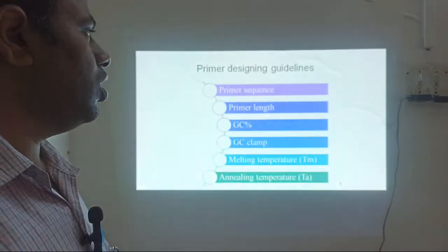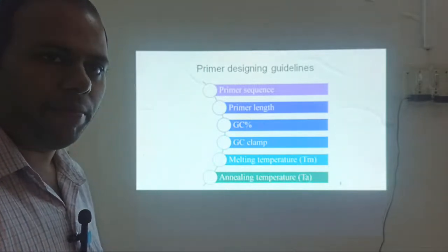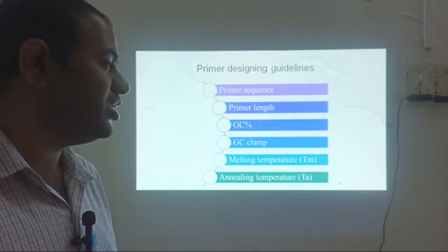The important thing here is primer designing. How to design the primer? Normally the DNA is present in any organism. The important thing is primer designing.